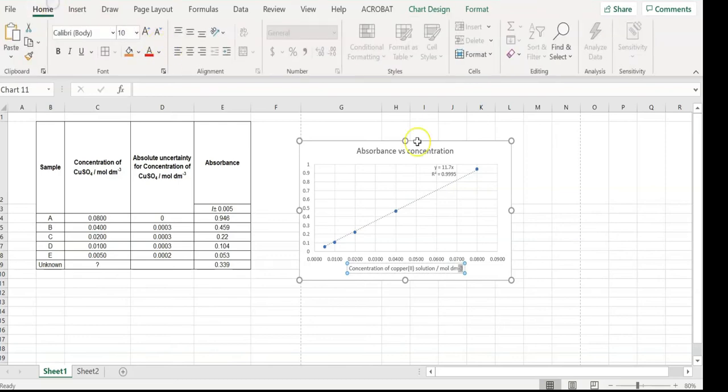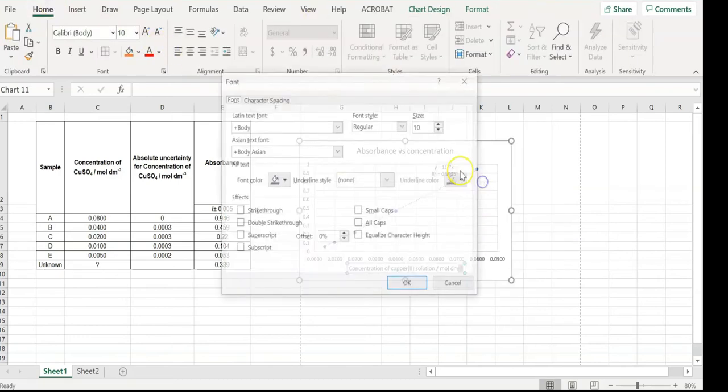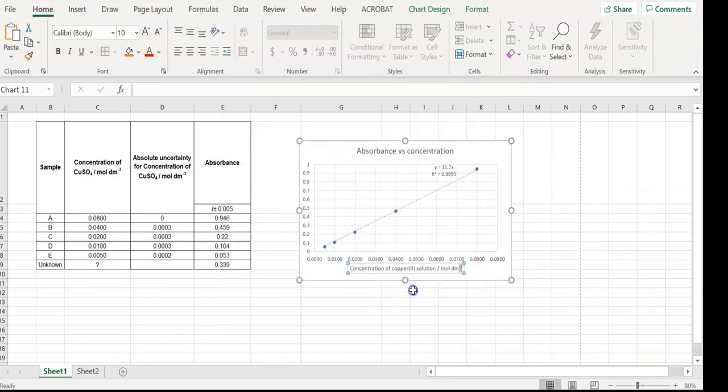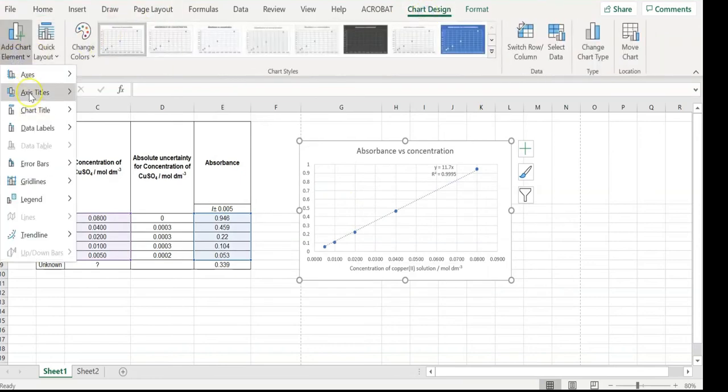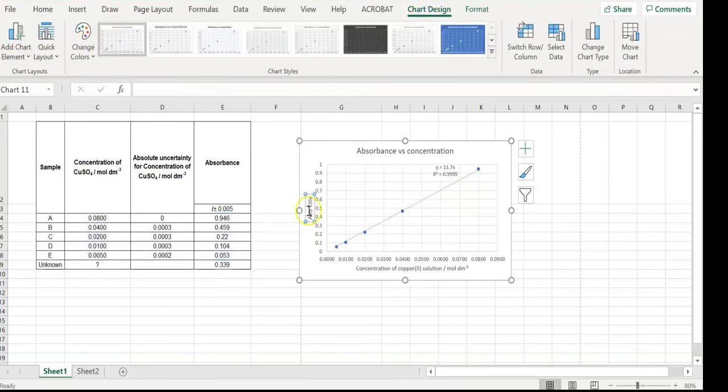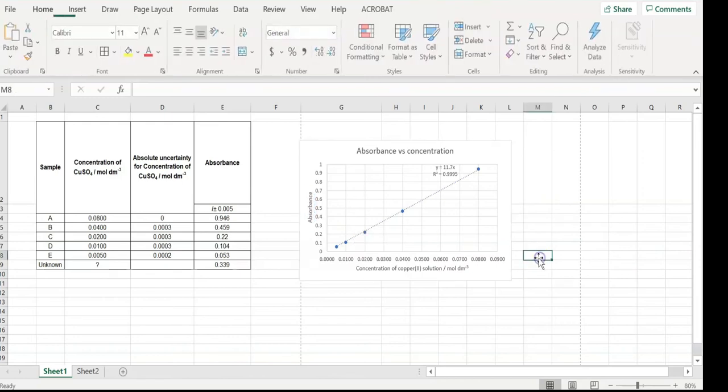Okay, so you wouldn't be able to find a superscript. You can actually right click, go to font, and do a superscript. If you know your shortcut, please go ahead and do it. So let's repeat the same, and we're going to do on the y-axis under our axis titles, under vertical axis. So over here, we can change this to absorbance, and we get our calibration curve plotted from here.